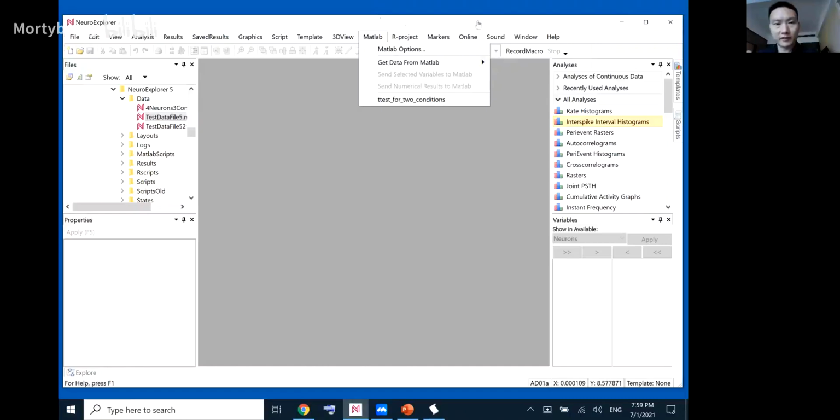Maybe we can try that function for the connection. Yes, but maybe I need to talk to engineers to make sure that I have the latest protocol, because it was done a few years ago, so I'm sure stuff may have changed, and I need a test program so I can debug it here at home. Yes, I see. Also, our R&D is developing a new platform. It includes hardware and software, and maybe in the future we will try to make it compatible with NeuroExplorer, to send data or to get data from NeuroExplorer.